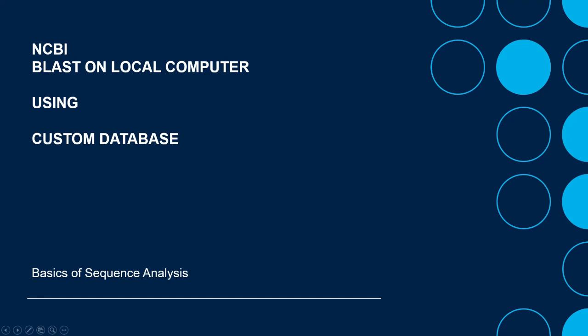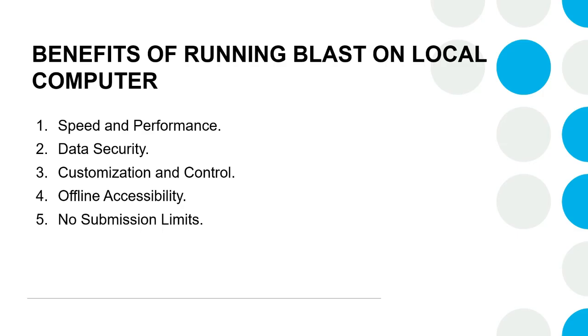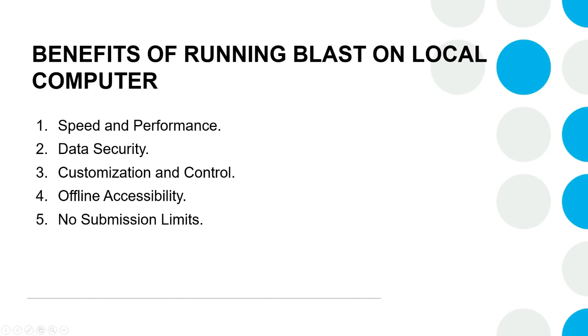Hi, welcome. This is the second tutorial on BLAST analysis. In our previous tutorial on BLAST, we learned about the BLAST web interface, which is the most common way of BLAST usage. In this video tutorial, we will learn how to install BLAST on your local computer and run using a local or custom database. Running BLAST on local computer brings several advantages.